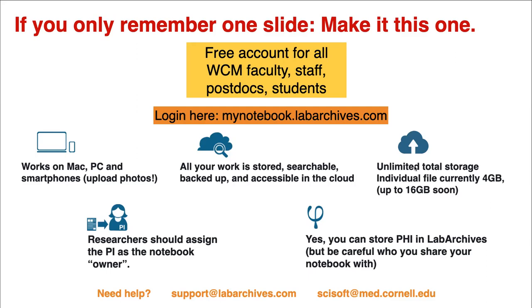And since each individual can have many notebooks, what LabArchives suggests is not to have more than 40,000 entries per lab, and try to keep it below 1 terabyte of content per lab, just to facilitate the search. Two more important things: one, in the lab, each individual researcher should assign the ownership of the notebook to the PI. I'm going to show how to do it. And the other important thing is, yes, you can store PHI in LabArchives.